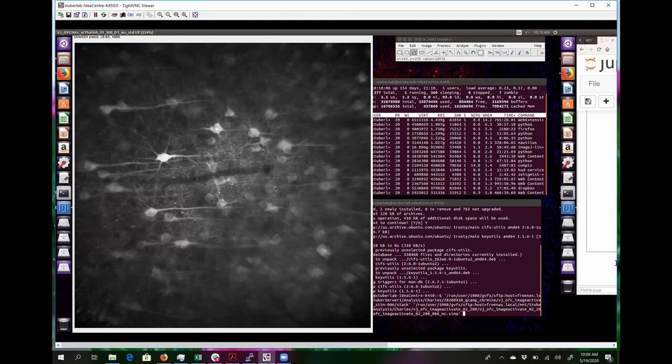So this is not super related to the actual ROI drawing, but over the course of days when you're tracking the same field of view, do you notice the cells, I guess the tissue, kind of moving around or warping? And then what about the blood vessels? Do the blood vessels largely stay in the same relative space?